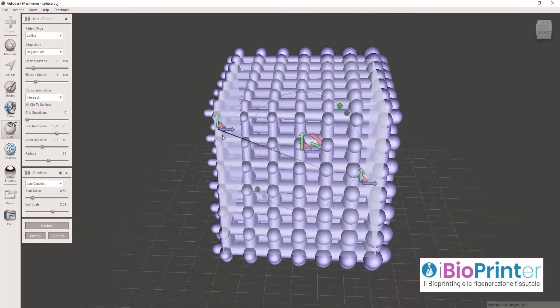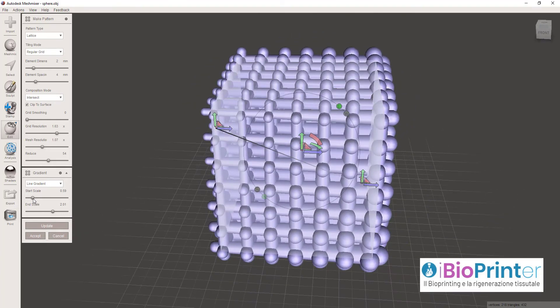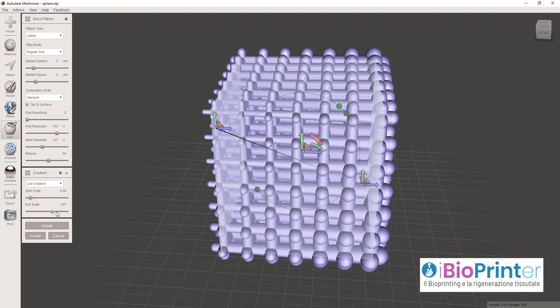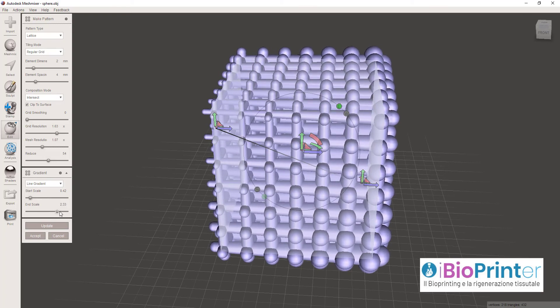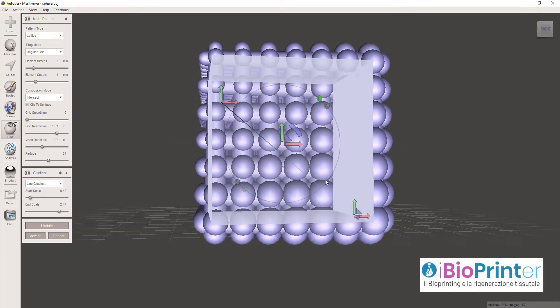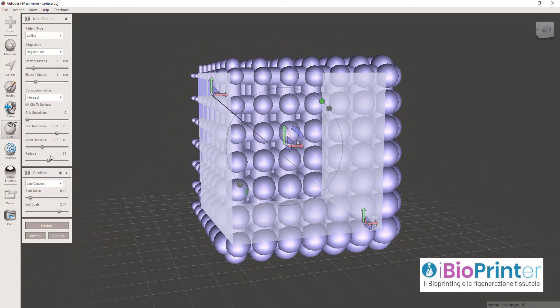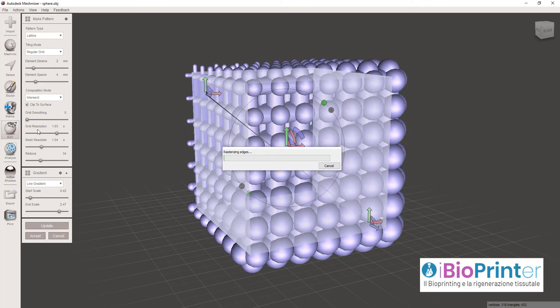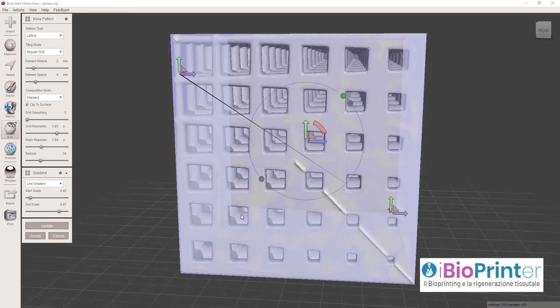Questo gradiente può essere spostato nello spazio come vogliamo. Se accentuiamo ancora questa differenza e andiamo a cliccare su Update, prima facciamo qualche aggiustamento sulla qualità della mesh, quindi clicchiamo su Update.